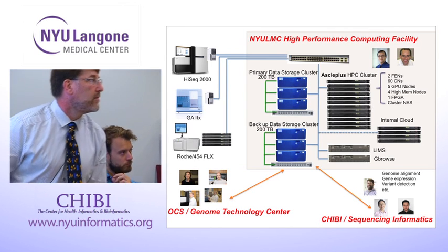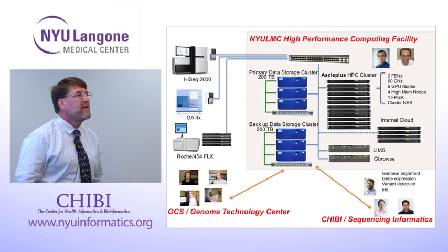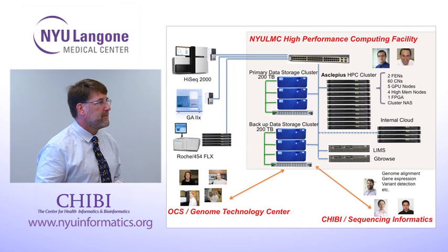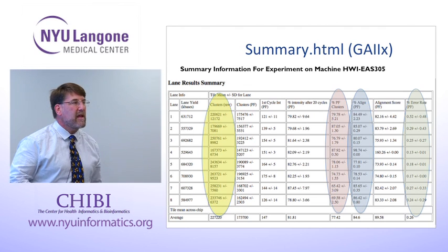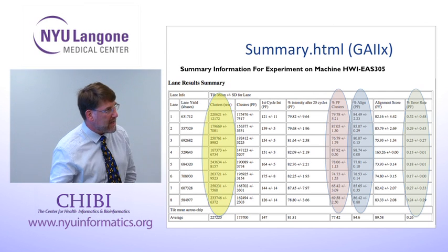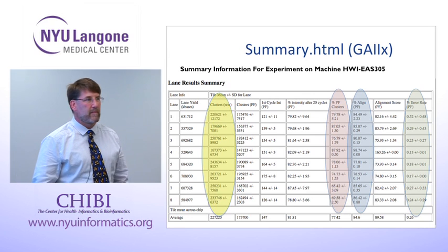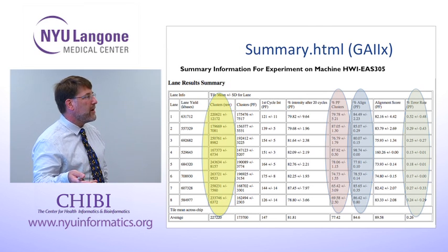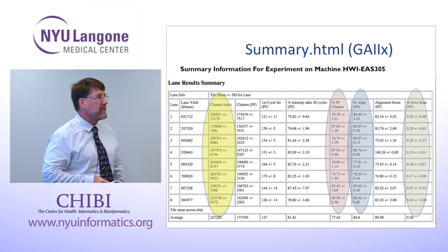What's the range of data, amount of data? From a few gigabytes to many hundreds of gigabytes per experiment. Was that before or after the analysis? Yeah, it grows as we do more analyses, right? And so frequently you need to do it this way, and then that way, and then the other way, and those things just grow. And so by the time you're done, you're in the terabyte range? You can be. And also it depends how many samples were in the experiment, et cetera. It can be, but usually hundreds of gigabytes is a typical project.